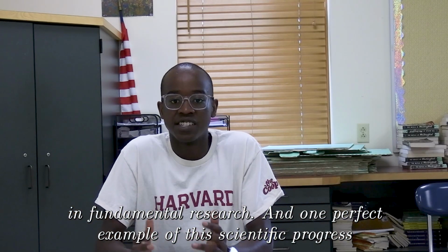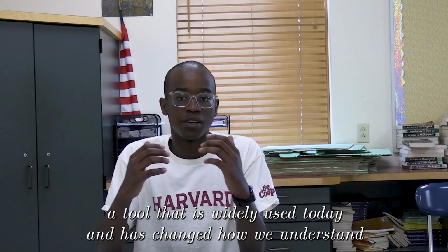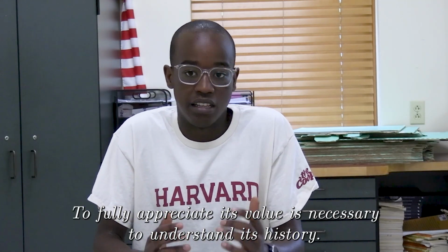And one perfect example of this scientific progress is the invention and development of the mass spectrometer, a tool that is widely used today and has changed how we understand atoms, molecules, and even matter itself. To fully appreciate its value, it is necessary to understand its history.